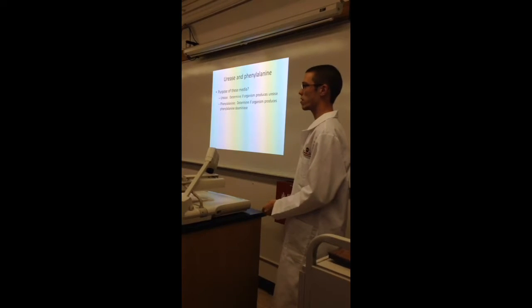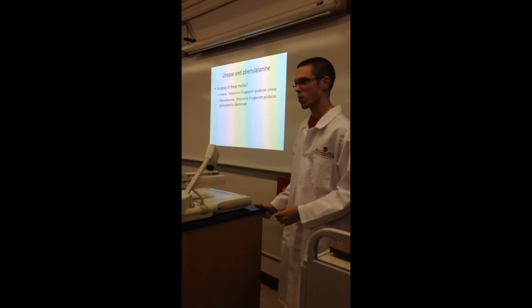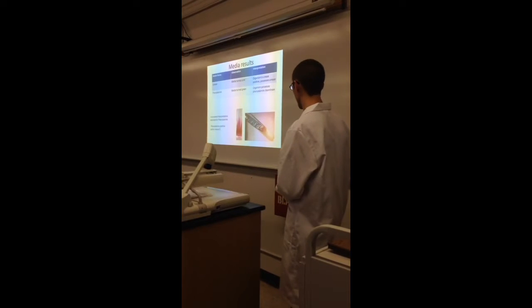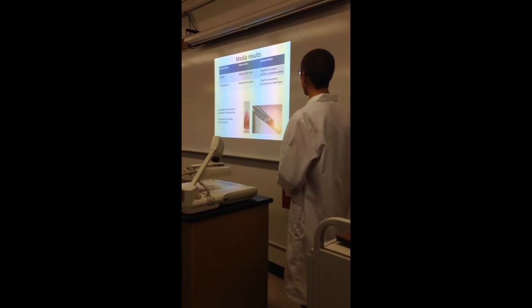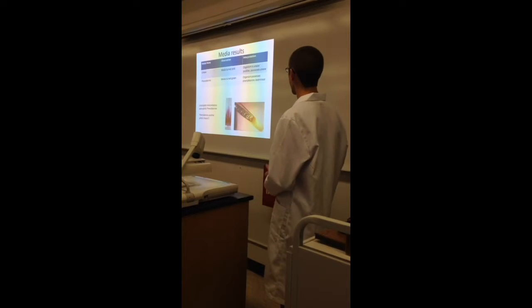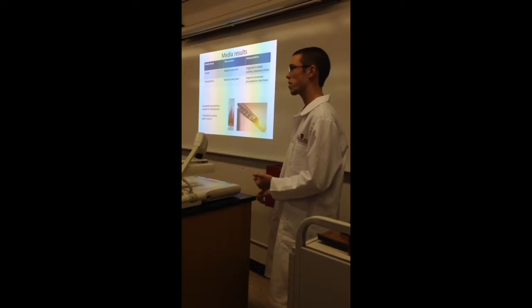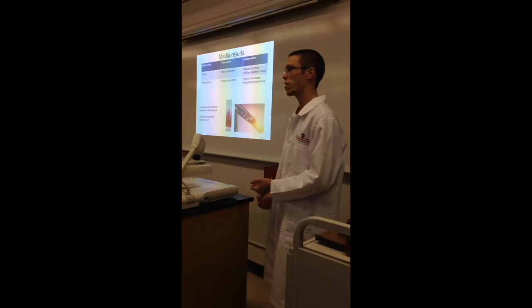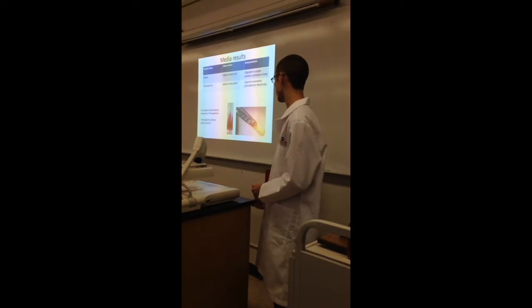Urease is easy. The phenylalanine takes a little bit more to remember because the purpose and the enzyme you're looking for isn't directly in the name of the media. And for the media results here, if you remember, urease starts off as orange, and so if it turns pink, that's positive. So you can say urease positive or possesses urease, either of those is fine. And for phenylalanine deaminase, you want to make sure that you say it contains phenylalanine deaminase or is phenylalanine deaminase positive. If you just say it's phenylalanine positive, then that's only partial credit. So this one turns yellow to green.